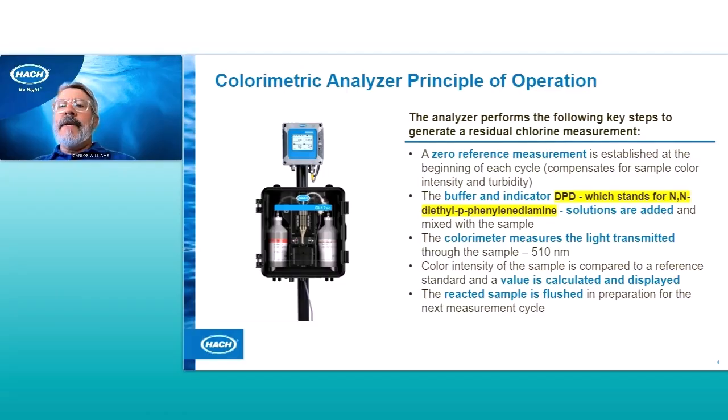And then the last step is the sample cell is flushed and cleaned with a new sample before it's reacted with the next round of buffer and reagent.